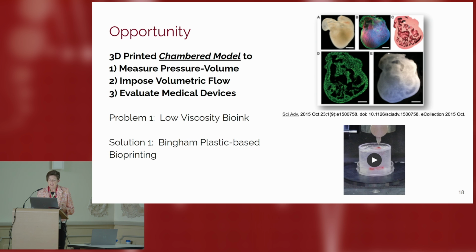So I have lots of interest in my lab in 3D bioprinting. It seems like all graduate students are very interested in that concept. And actually in our lab, it makes sense because our ECM formulations lend themselves very well to a bioink that you might consider 3D printing. And that, together with some industrial collaborations that we have with some of our local medical device companies, who are interested in human model systems of cardiac tissue. And more than just a strip of tissue, they're really interested in something where we could measure pressure-volume dynamics and impose volumetric flow, and ultimately evaluate clinical grade medical devices. So it has to be fairly large and ideally chambered in a way that can be perfused with fluid. So it was a tall order.